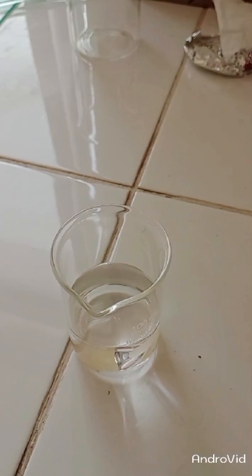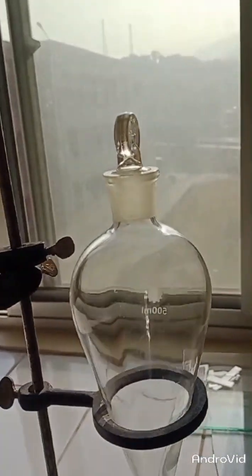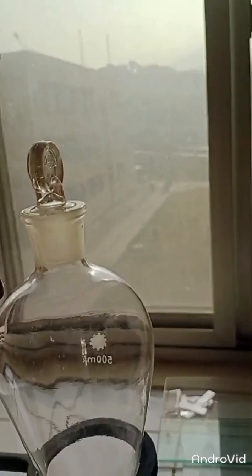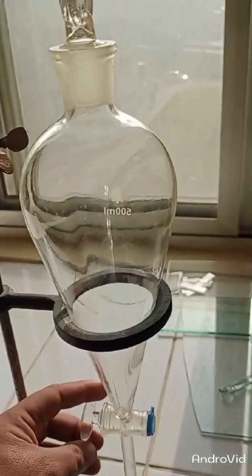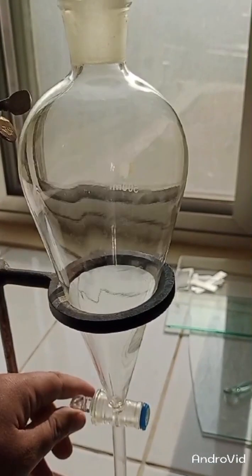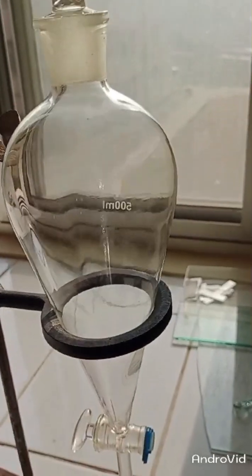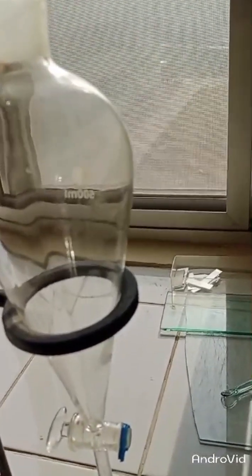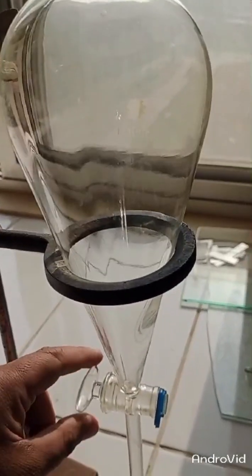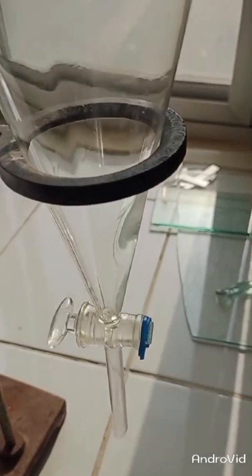Before pouring our solvents into this separating funnel, make sure that your cork should be tightly packed, because your solvent can escape from the cork if it is not tightly sealed.